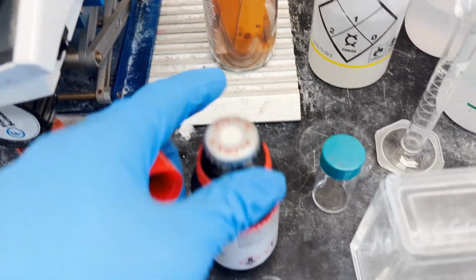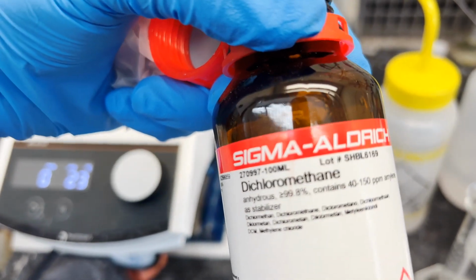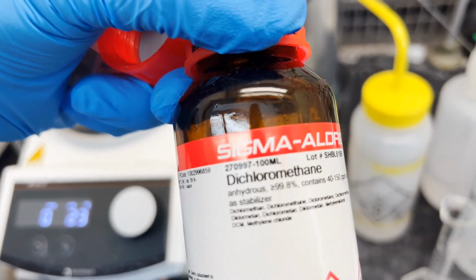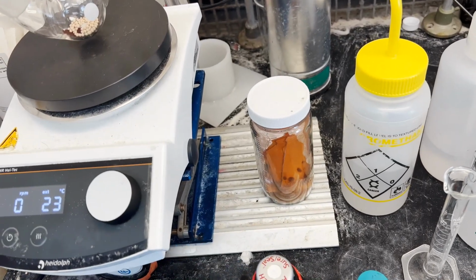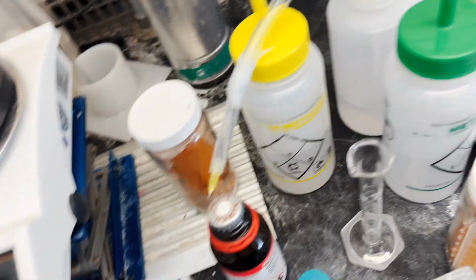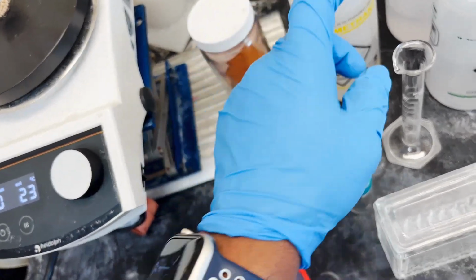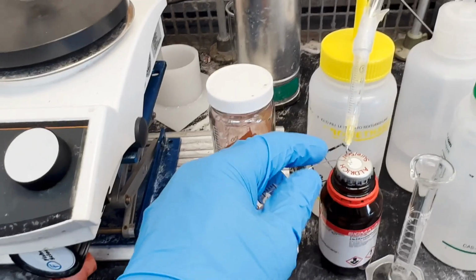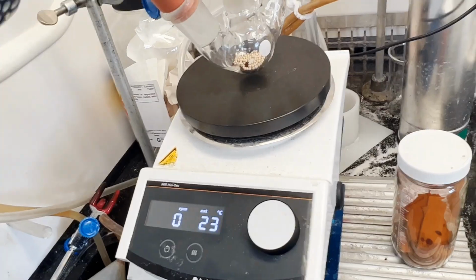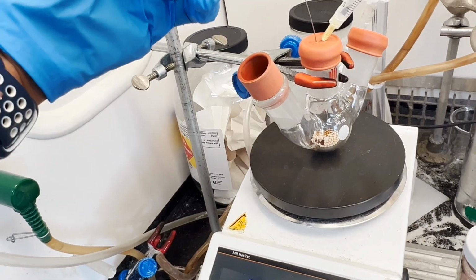So here I'm using anhydrous dichloromethane. There are lots of solvents you can use for this kind of reaction, like methanol, ethanol, dichloromethane, or chloroform, based on your reaction system and the solubility of your starting material. I'm going to use anhydrous dichloromethane here. What I was saying, the molecular sieves will take the water out of the reaction, and it will make your Schiff base stable in the reaction. That's why you have to use molecular sieves.